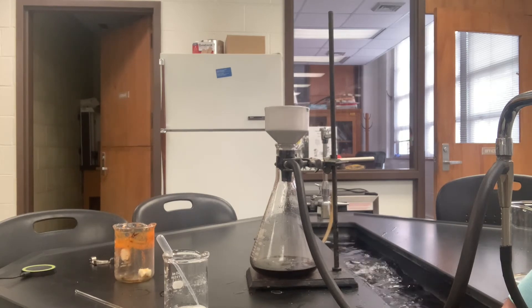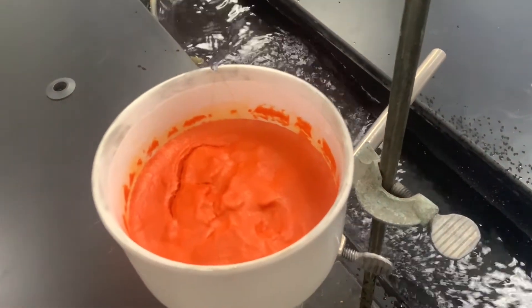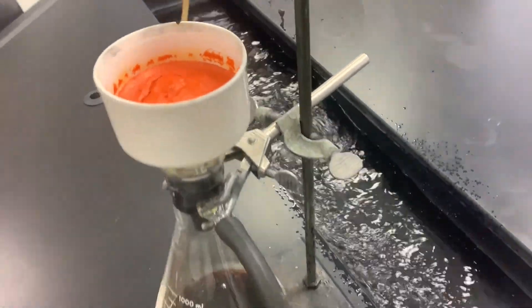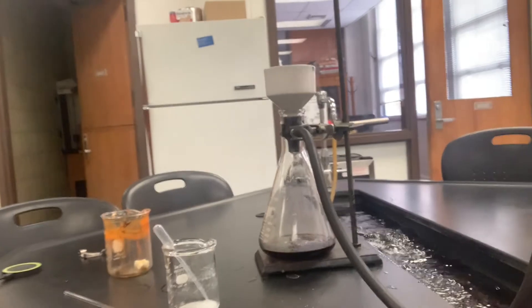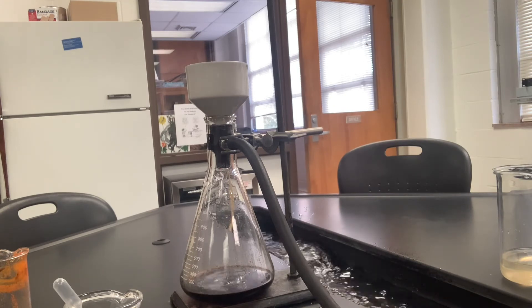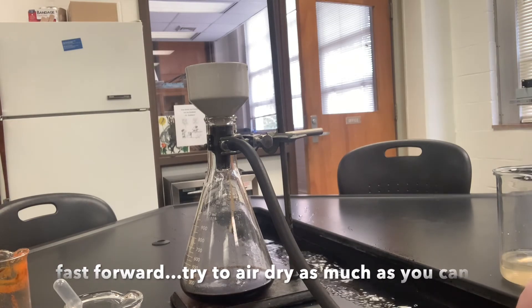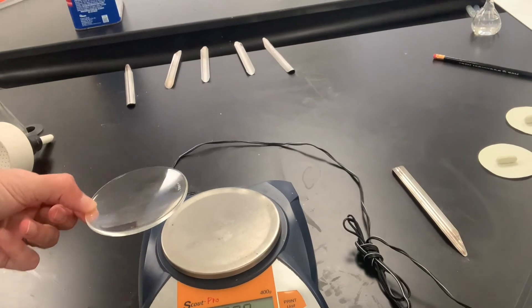Let me show you what the substance looks like right now. We're just applying a vacuum for a few minutes to make sure that the sodium chloride wash comes through. It's a bit of a waiting game now. Because it's aqueous, the water takes a very long time to evaporate. Now we're going to weigh a watch glass and record this weight for later to do a subtraction — make sure you record the watch glass weight.